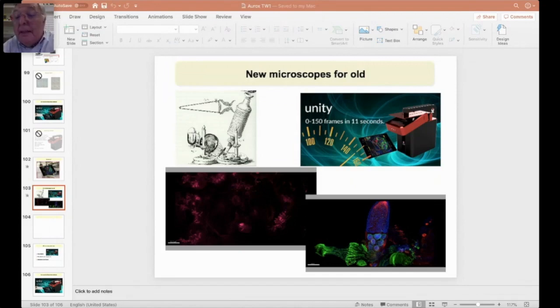I think you really need to look for a laser physicist here because of confocal resonators. Well, this is the whole thing. If you know a confocal resonator, you wouldn't call it a confocal microscope, you'd call it a concentric microscope because it's not a confocal. But I think we're being a bit too anarchic about this. It could be Kjell Carlsson, it could be Niels Aslund. I wouldn't know. They were amongst the earlier people, and Niels Aslund had a company, the name of which I can't remember, which was selling beam scanners early on. You could be right. I really do not know.